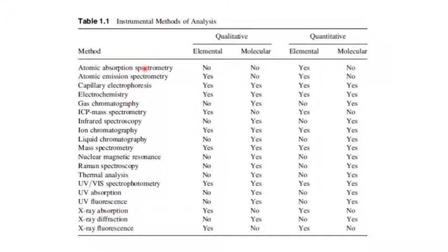It basically burns it into its constituent atoms. And so it makes sense that it's not very good for qualitative measurements, because in the sense that maybe it tells you what element you have present, but it's okay for quantitative measurement. It will tell you how much of a specific element you have, whether that be iron, calcium, whatever it happens to be.